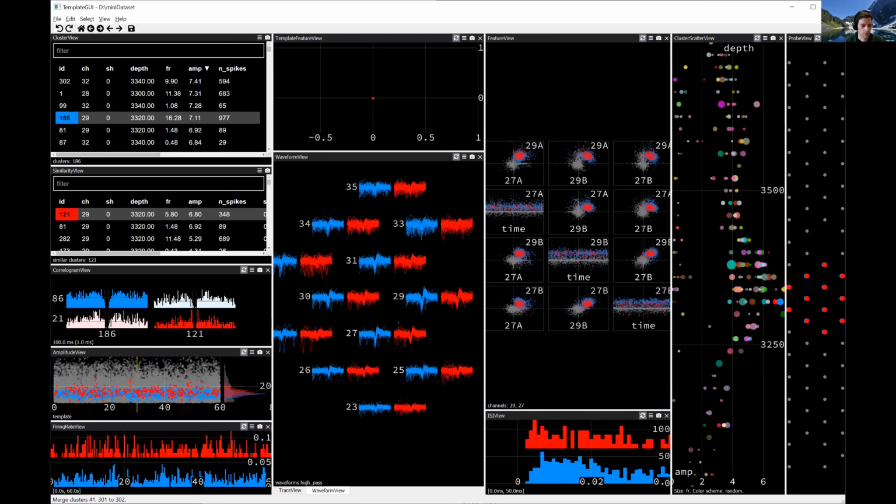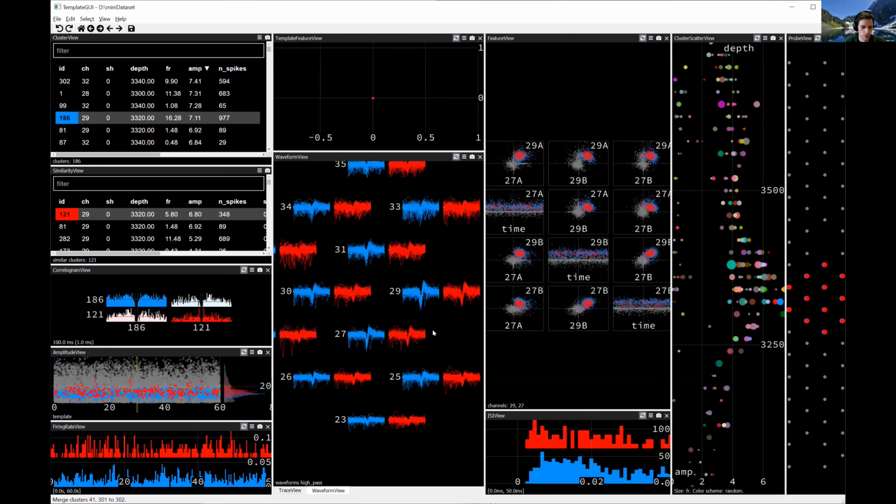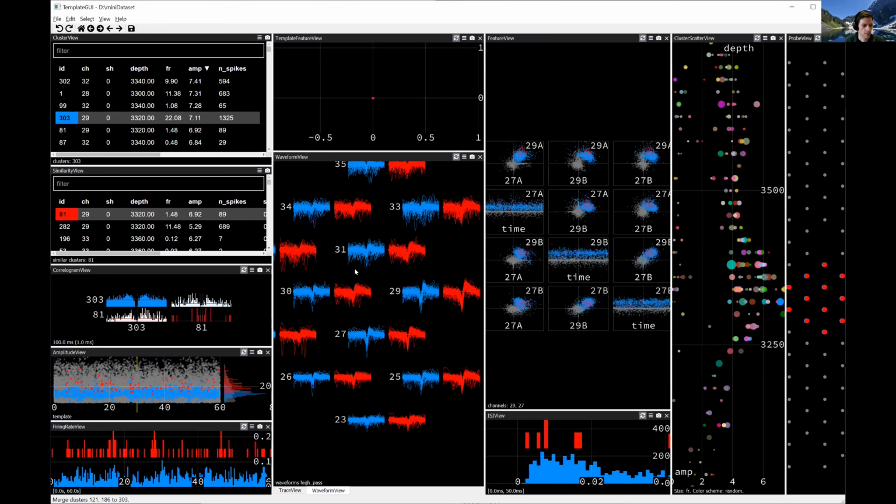Okay, and this is now a great example. Both of these neurons have pretty similar autocorrelograms, but look at the cross-correlogram. The cross-correlogram has the same size dip in the refractory period as both of the neurons' autocorrelograms. And this is a really good indication that these two units need to be merged with each other, because for them to share a refractory period like that with millisecond precision is really unlikely to happen unless they're really the same neuron. And we can just double check that by overlaying the waveforms and indeed seeing that these neurons have super similar waveforms to each other. So we will merge. And then we would want to go through that multiple times.